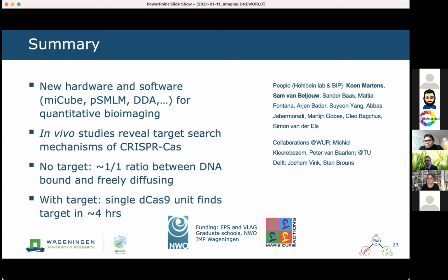Along the same lines, you showed Andrew York's work and your secret collaborations with him. So what's the plan for that, the single objective light sheet? You have another module that you will... No, I don't know. I like his approach of doing science, doing open science a lot. I would love to build a single objective light sheet, but yeah, funding. The objective companies are selling objectives, and they earn a lot of money on that.